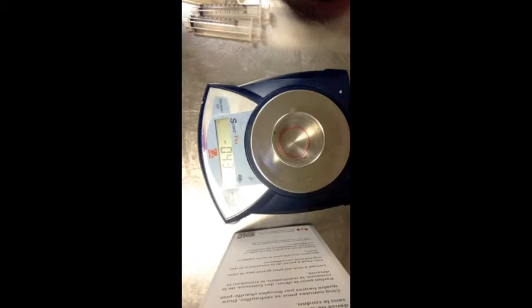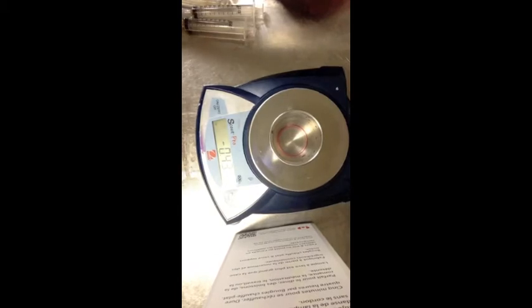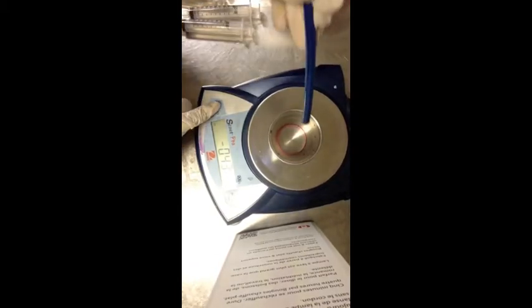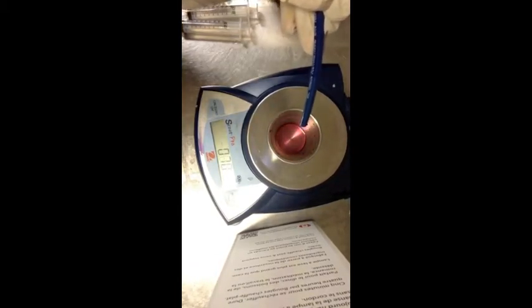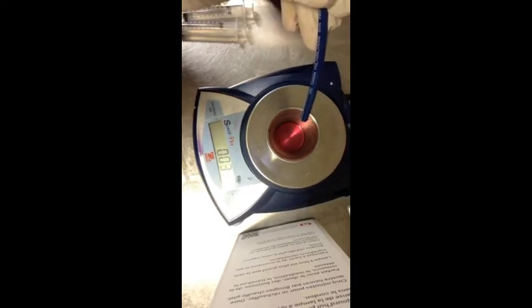This machine will fill up to 7 ml per stroke. We're trying to fill about 1 ml per stroke right now.